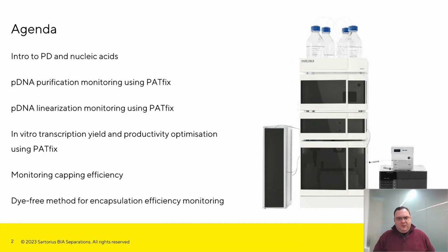Then we're going to talk about pDNA purification monitoring and linearization. And then once we have our pDNA linearized, we're going to jump into in vitro transcription yield and productivity optimization, how to monitor capping efficiency, and our newest method that we're developing, dye-free method for encapsulation efficiency monitoring.